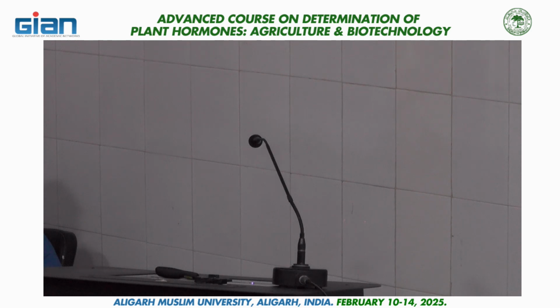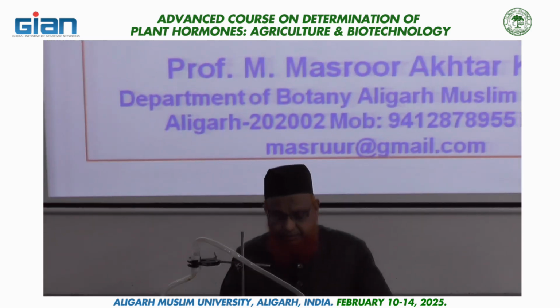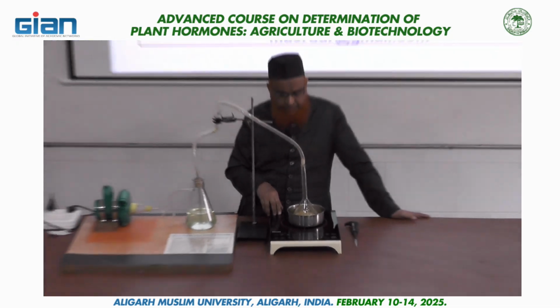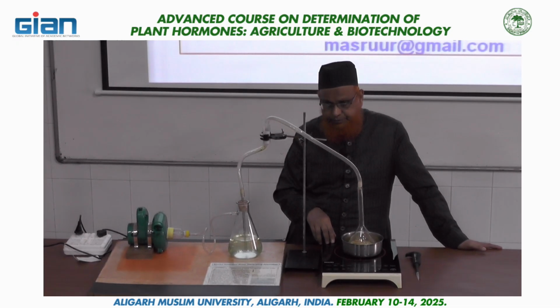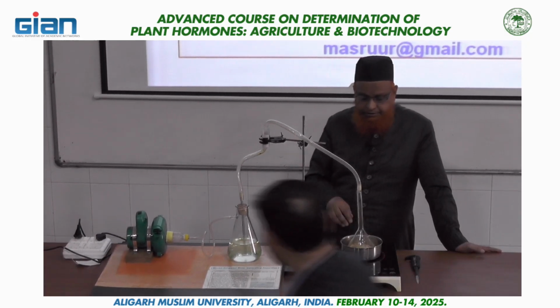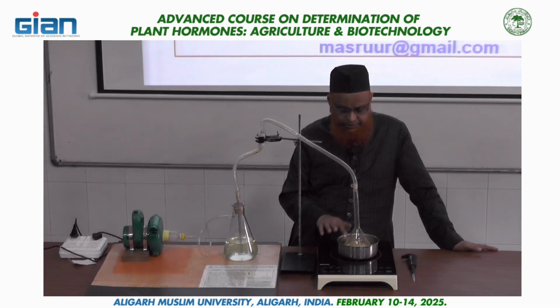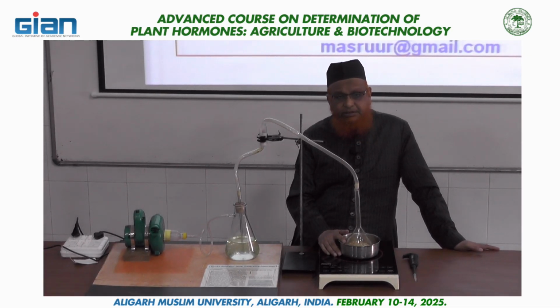So these are the different parts of this smoke generating plant. This is an induction heater of Philips company. So first you have to start at full speed, then you can reduce it to minimum, okay? And then smoke will be generated by the heating of this straw. Inside this utensil, there is straw.